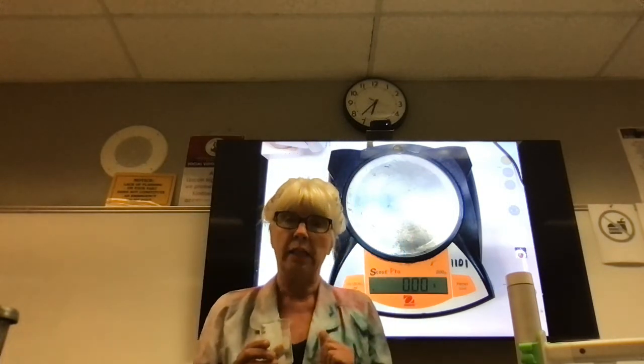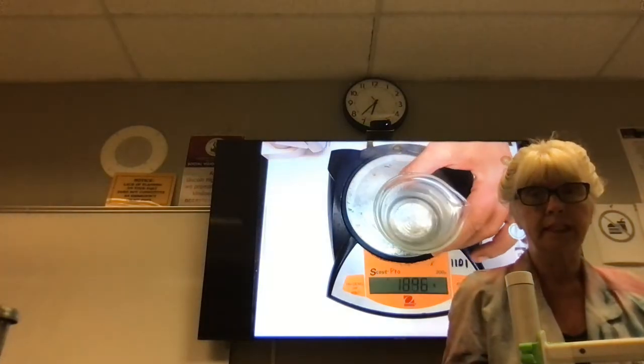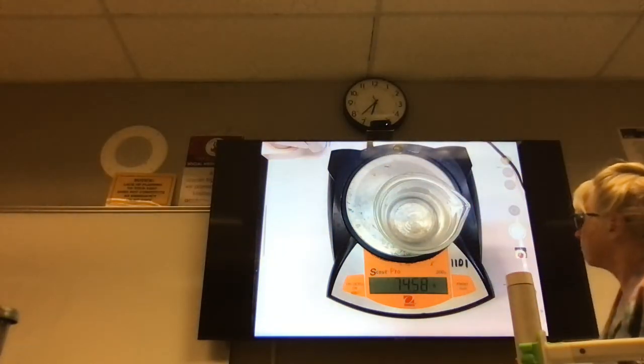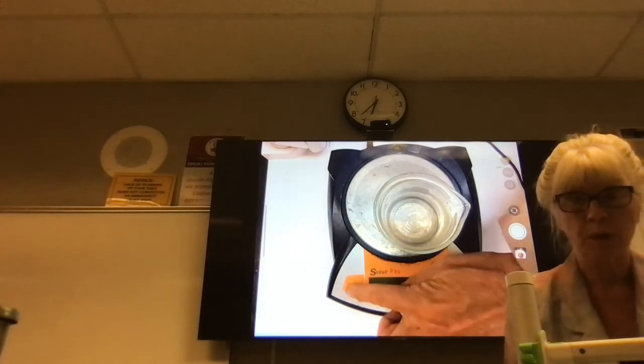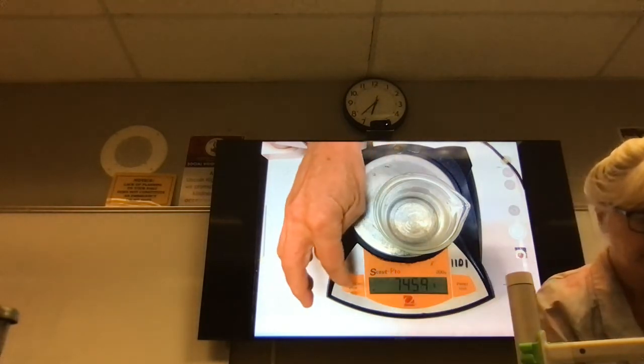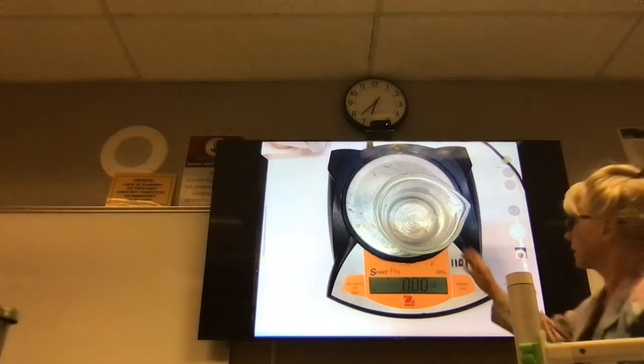In the next step, I have to take a 150 milliliter beaker and put it on a balance. Now, the thing that I'm going to do with the balance, and you can see right here, is that it has a mass, but it says to zero it. So I'm going to press the 0 button, okay? And now it's going to read a mass of 0.